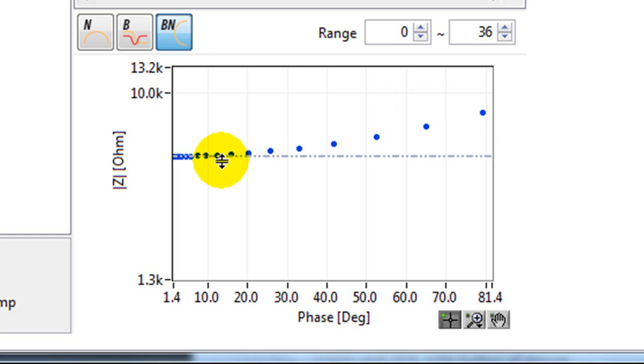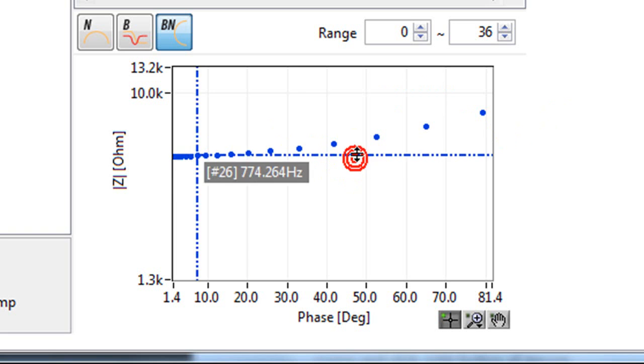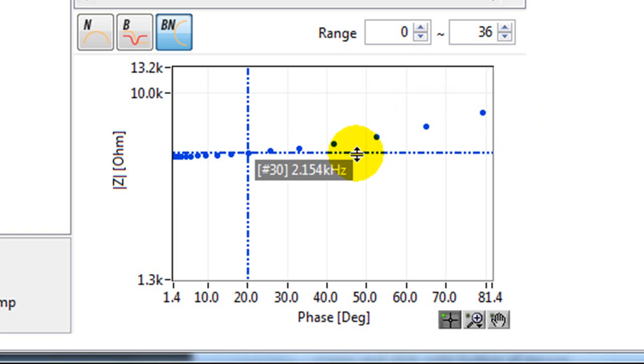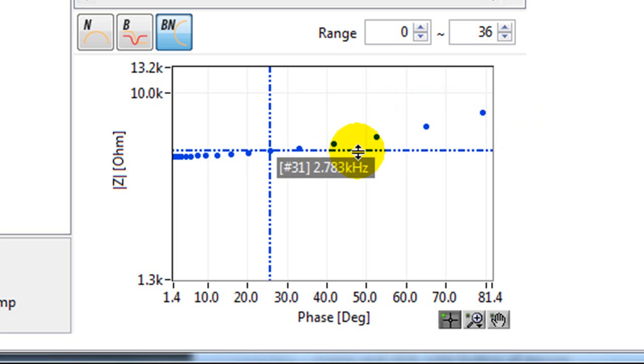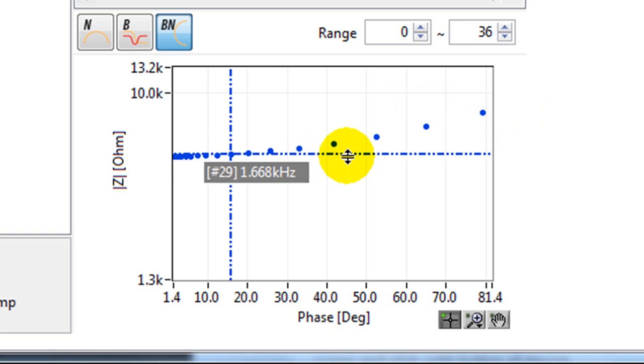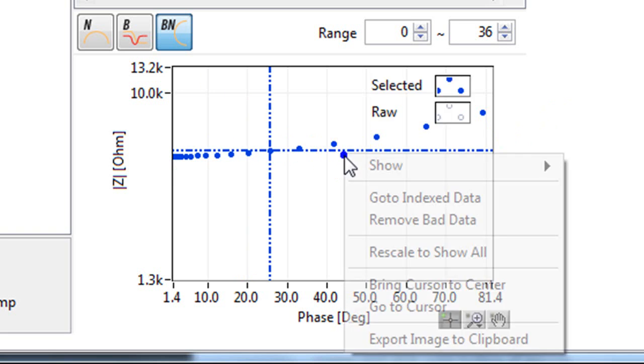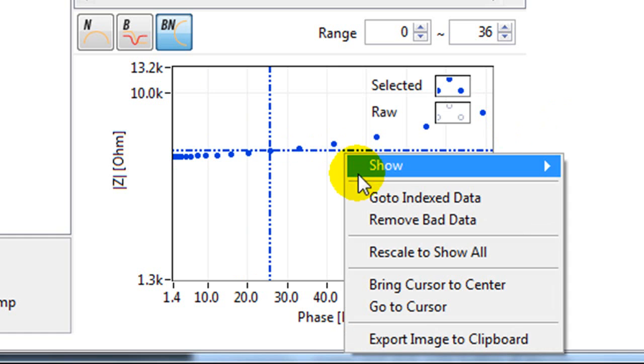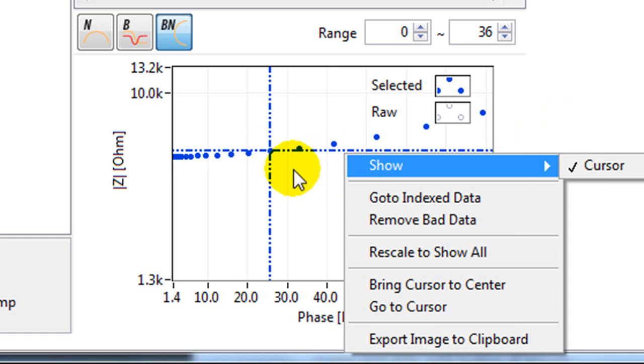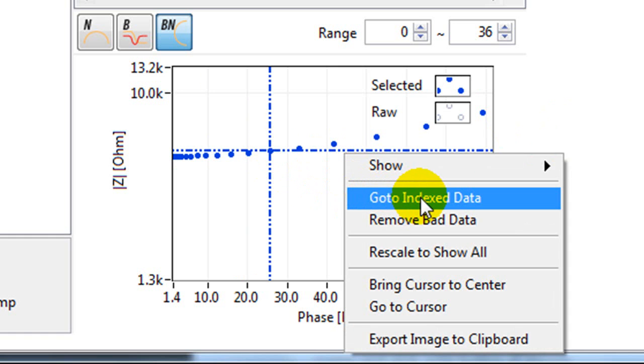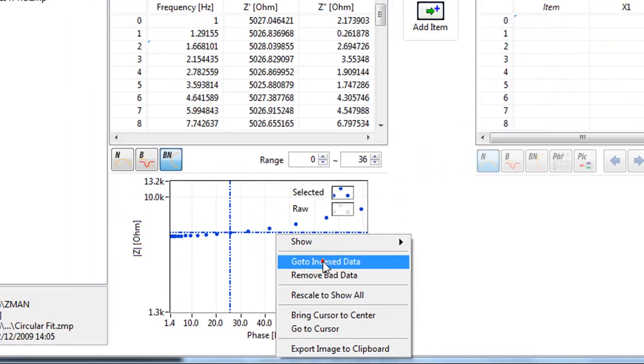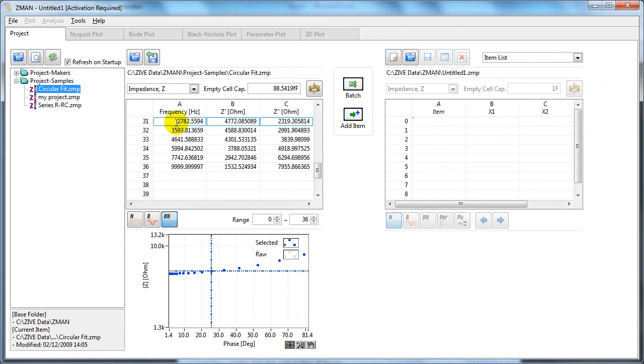Now we have a cursor here which we can move to a different data point. There it is showing the frequency as well. With the cursor, we can right click. For example, if we want to go to this indexed data, we can click here and this is that data point there.